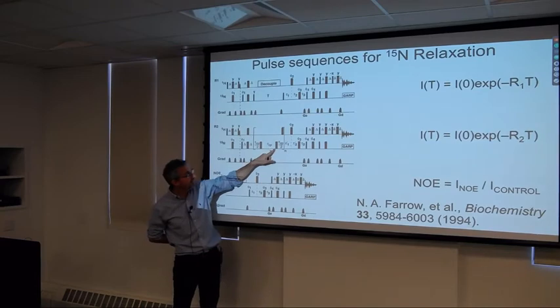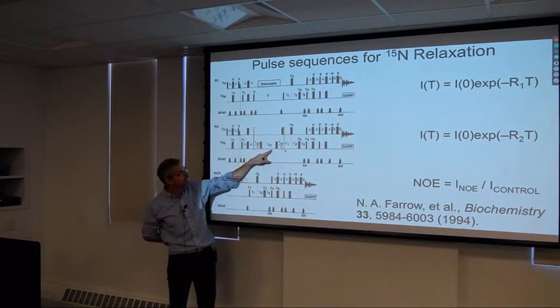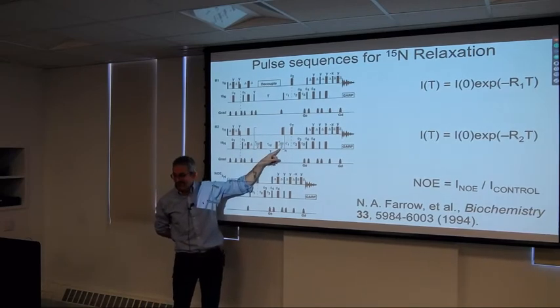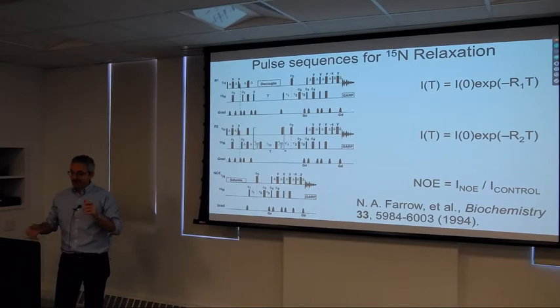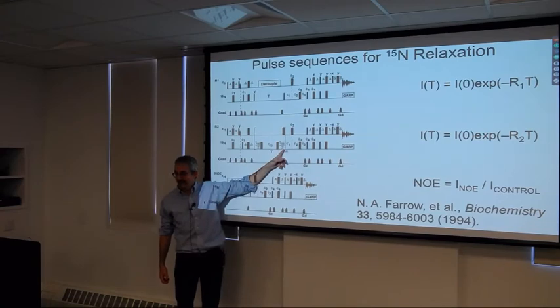It turns out that because of pulse imperfections, this sequence has the property of being somewhat compensated against pulse imperfections on the even echoes and not on the odd echoes. And one has to do either average Hamiltonian theory or numerical calculations to see that. But the even echoes are always better than the odd echoes. So this pulse has to occur at the top of an even echo.